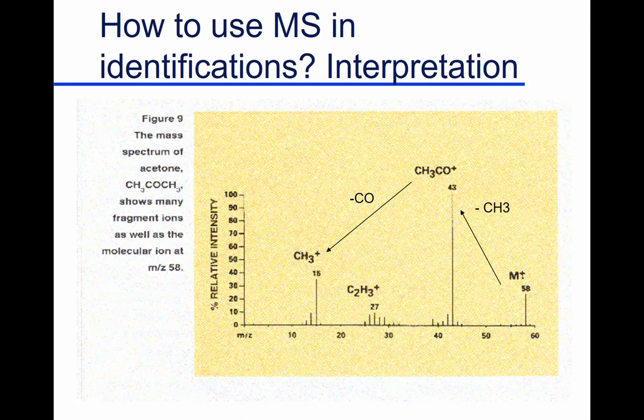Actually, I was at an international meeting, the American Chemical Society, and a professor from UC Davis was talking about pineapple wine. He identified the aroma components of pineapple wine, and he listed them, table after table after table. It drives you nuts. But anyway, when he was telling me about this, the order was wrong. Normally, you list your compounds in the order they come off your gas chromatograph, as they're fed into the mass spectrometer. And he had things that I knew came before other ones. It isn't possible. So my first question was, how could you have butanol coming off your GC before methanol? You showed that in your identification.